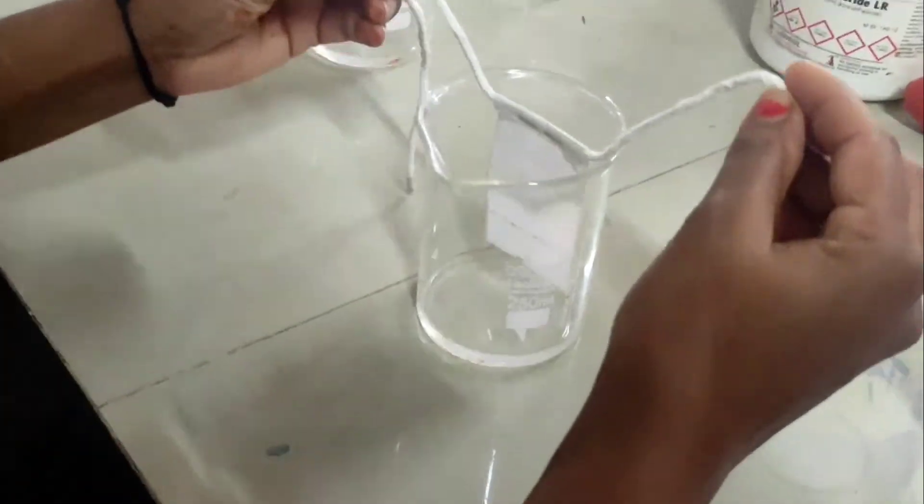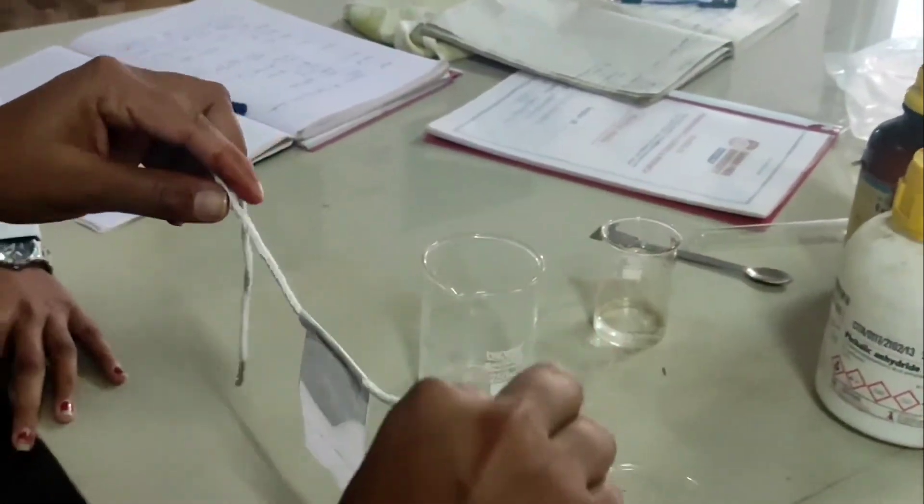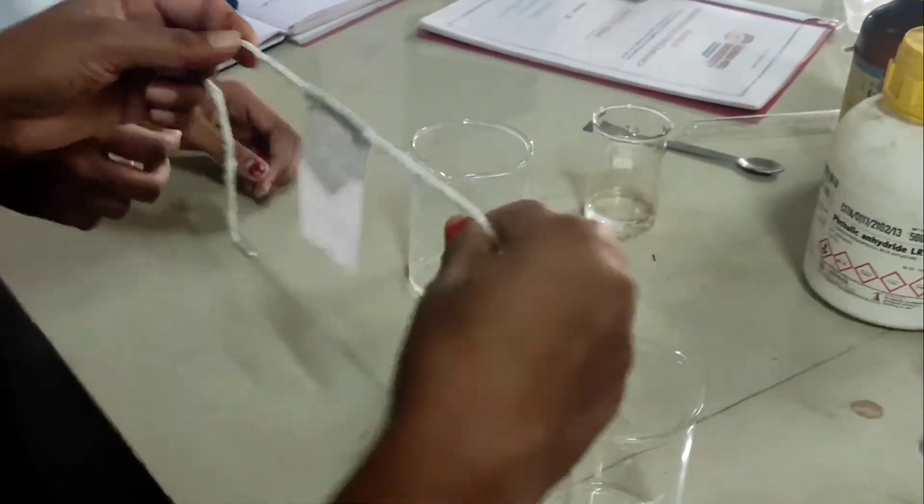Lastly, you have to calculate the RF value by using the formula: distance traveled by solute divided by distance traveled by solvent.